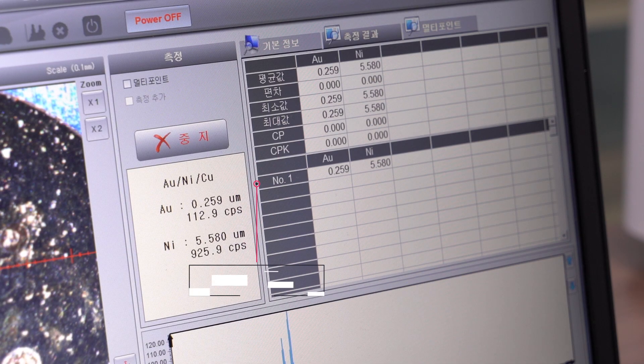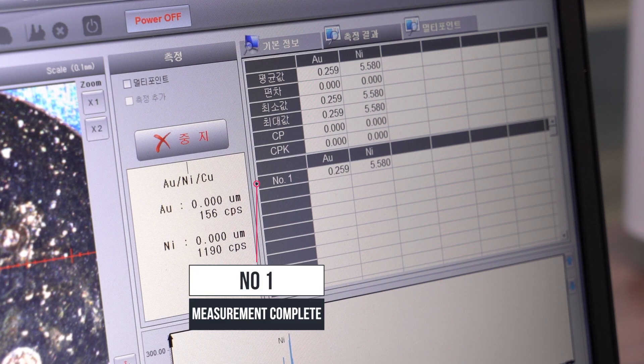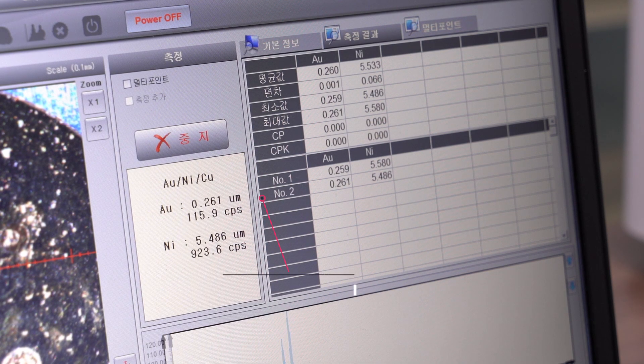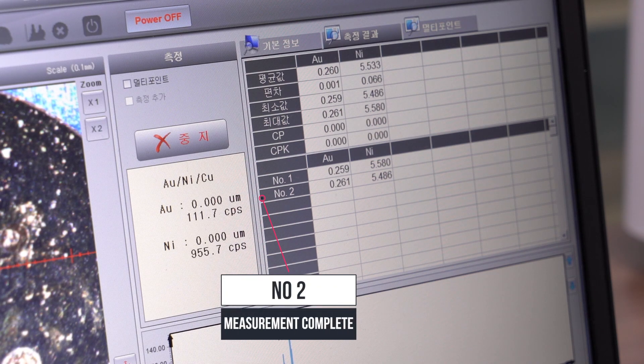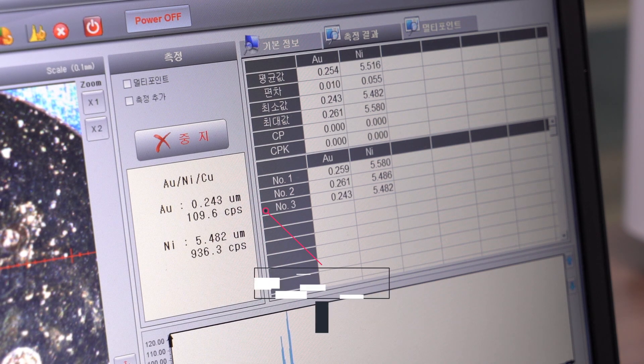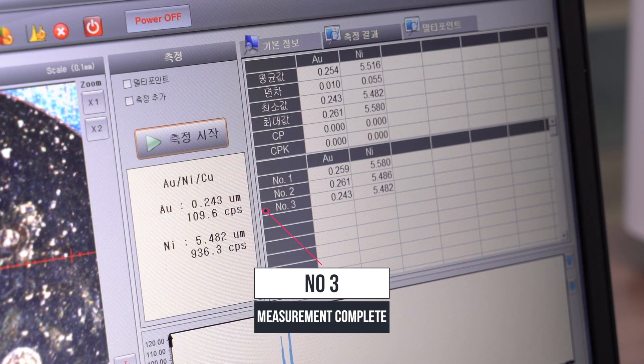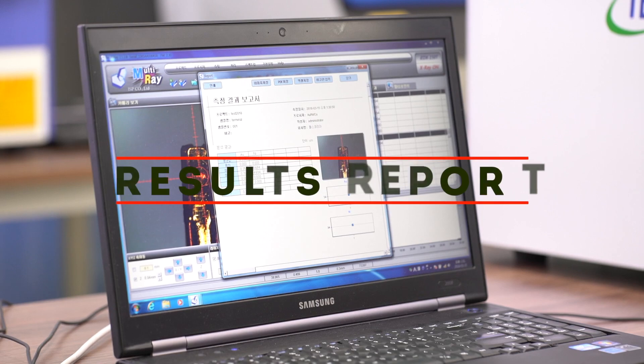First measurement result. Second measurement result. Third measurement result. You can view the results report.